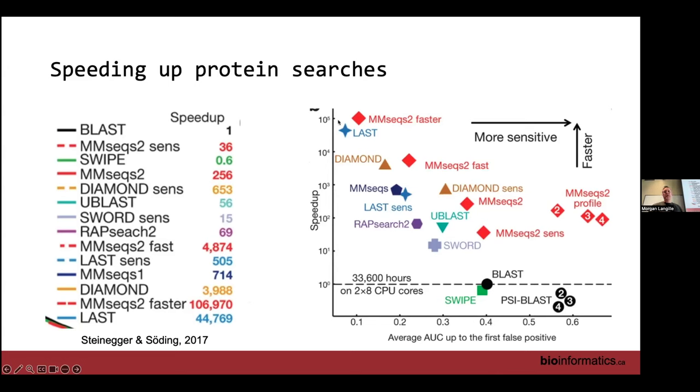I skipped over all the other steps. But after they get to that table, they do a lot of normalization. There's a lot of steps going in. I would say I believe it's the tool that has the most things going on to scale their reads to whatever they're calling as pathways. They're doing some gap filling, really interestingly. They're definitely using MinPath to remove spurious pathways. It's probably the more complicated approach on the steps after this.